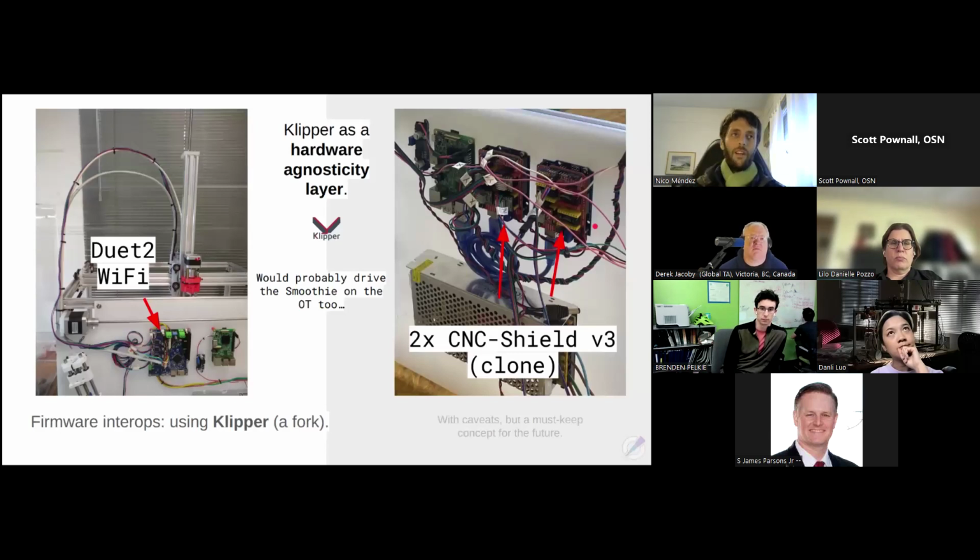And these slides will be interleaved with some notes on interoperability, because this has been one of the key design ideas or goals: to have interoperability with as many things as possible. The framework we chose to drive the machine is Klipper, which in my opinion is great in the sense that it is able to run on a really wide variety of microcontrollers.